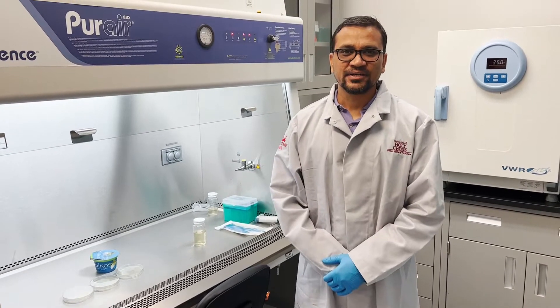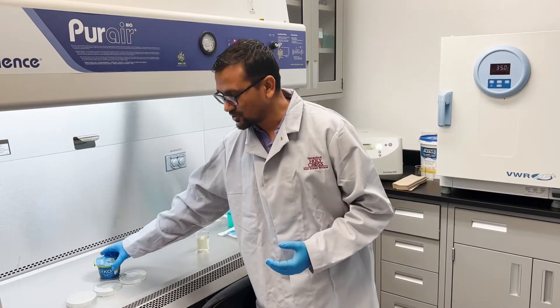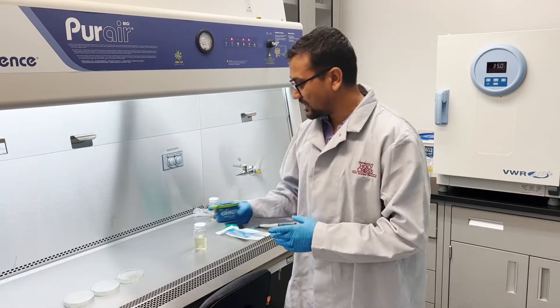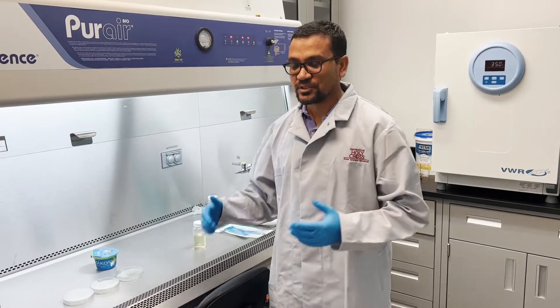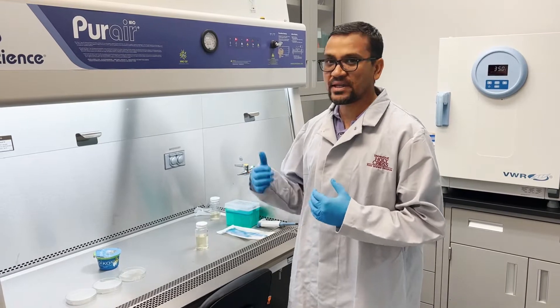To identify and grow the microorganisms from the Greek yogurt, I'm going to take a Greek yogurt sample and plate them in a nutrient agar media. We use nutrient agar media because we can grow many microorganisms in it.